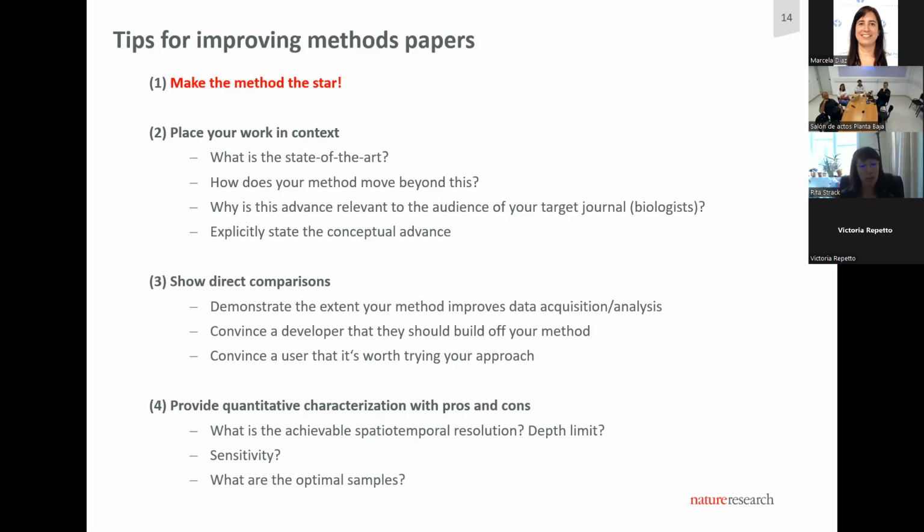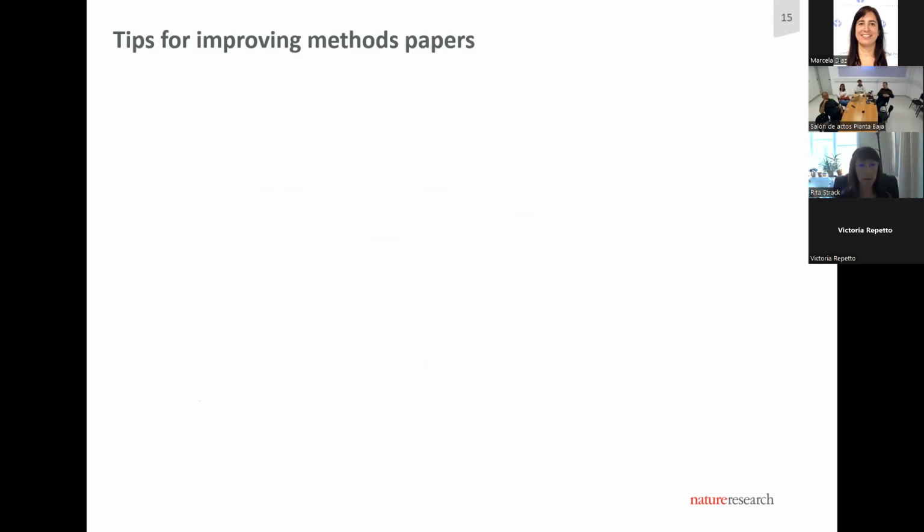How sensitive is your instrument? And sometimes, what are the optimal samples? Is your instrument really only suited for cleared tissues? Can it be used on things that have more scattering? So really characterizing these things is important for our papers.